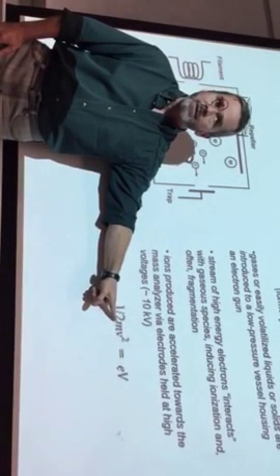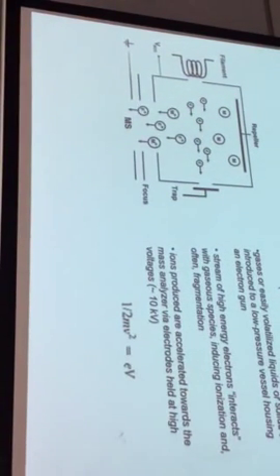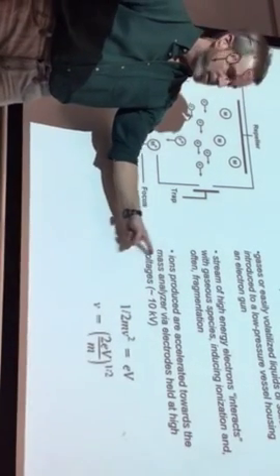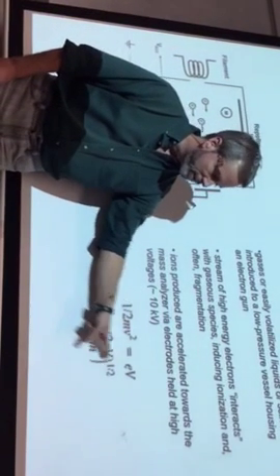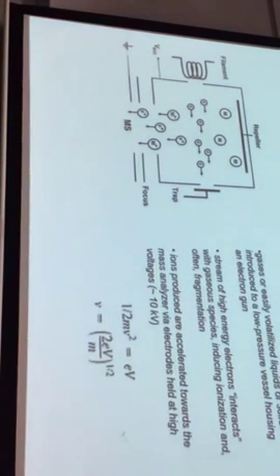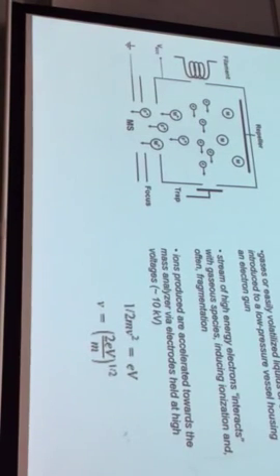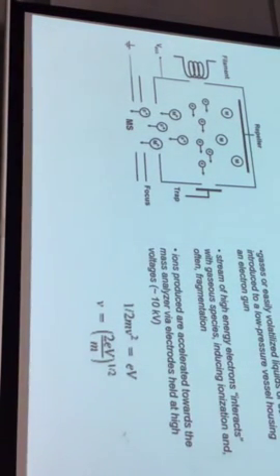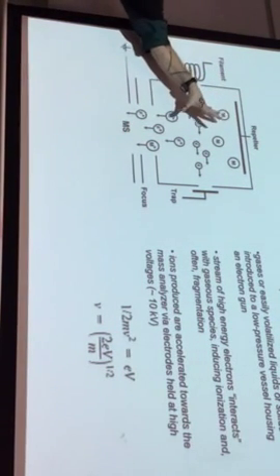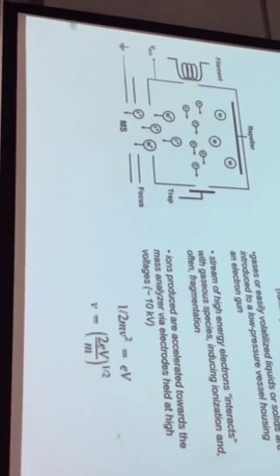Ions of different mass then will be traveling at different velocities, will they not? Yes, they will. All the ions are ejected with roughly equivalent kinetic energies, then that means the velocities will be inversely related to the square root of the masses. So this is one of our links. The ionized molecules and fragments are ejected with essentially equivalent kinetic energies as determined by the parameters of the ion source. But that means they come out moving at different velocities depending on their masses. Everybody good?